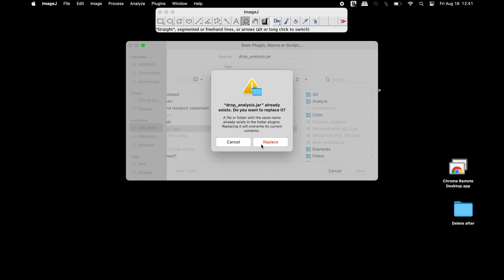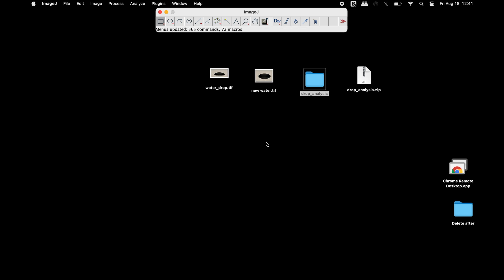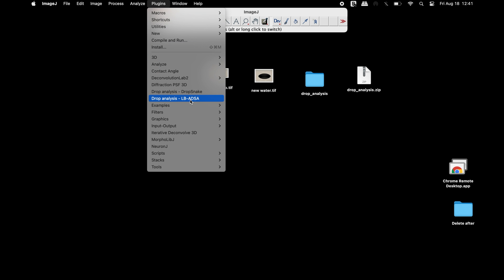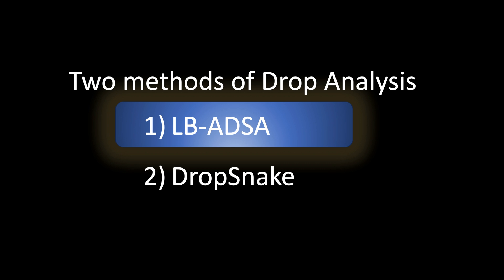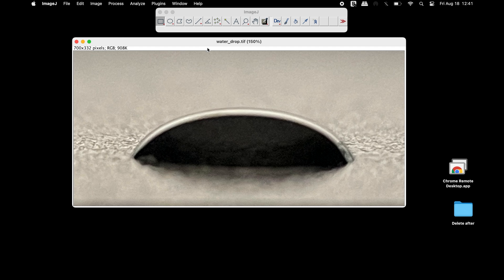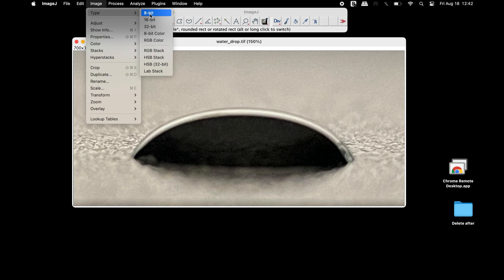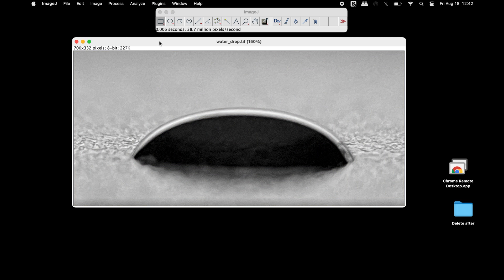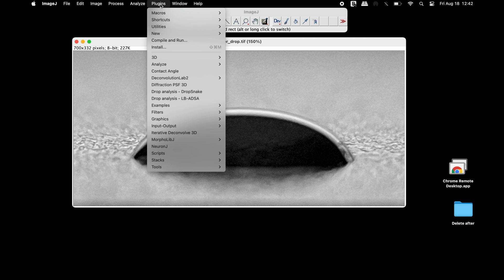To verify the plugin is installed correctly, click on Plugins and locate the Drop Analysis plugin. To measure the contact angle, open the image of interest using ImageJ. The first step is to convert the image type into an 8-bit image. Then head to Plugins and click Drop Analysis LBADSA.